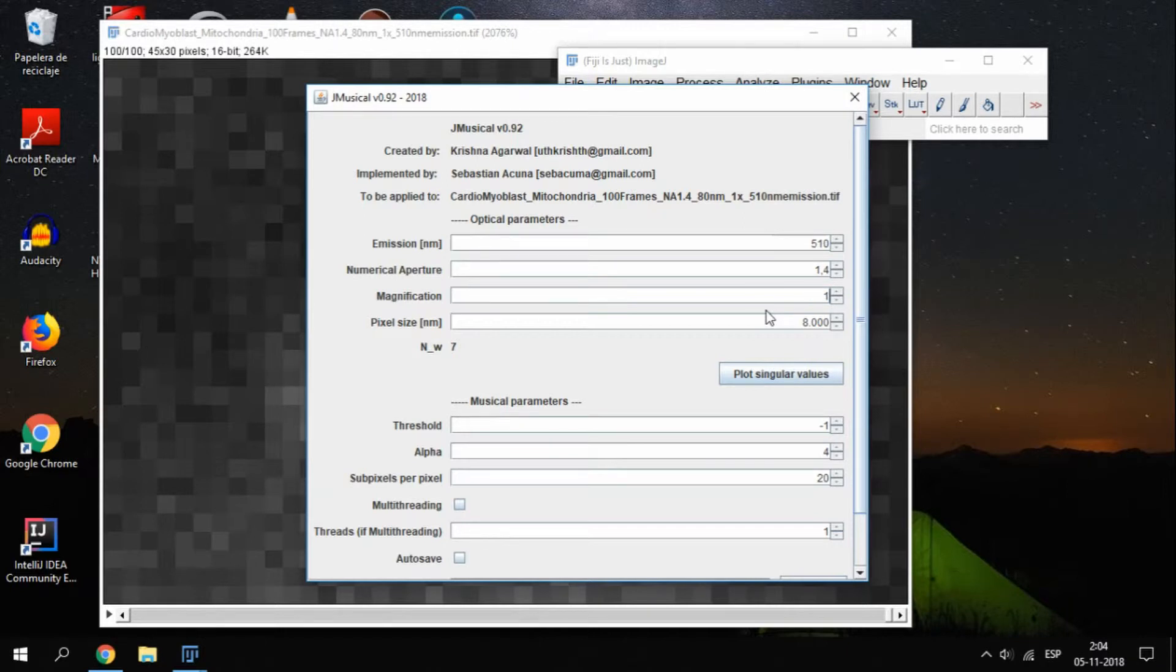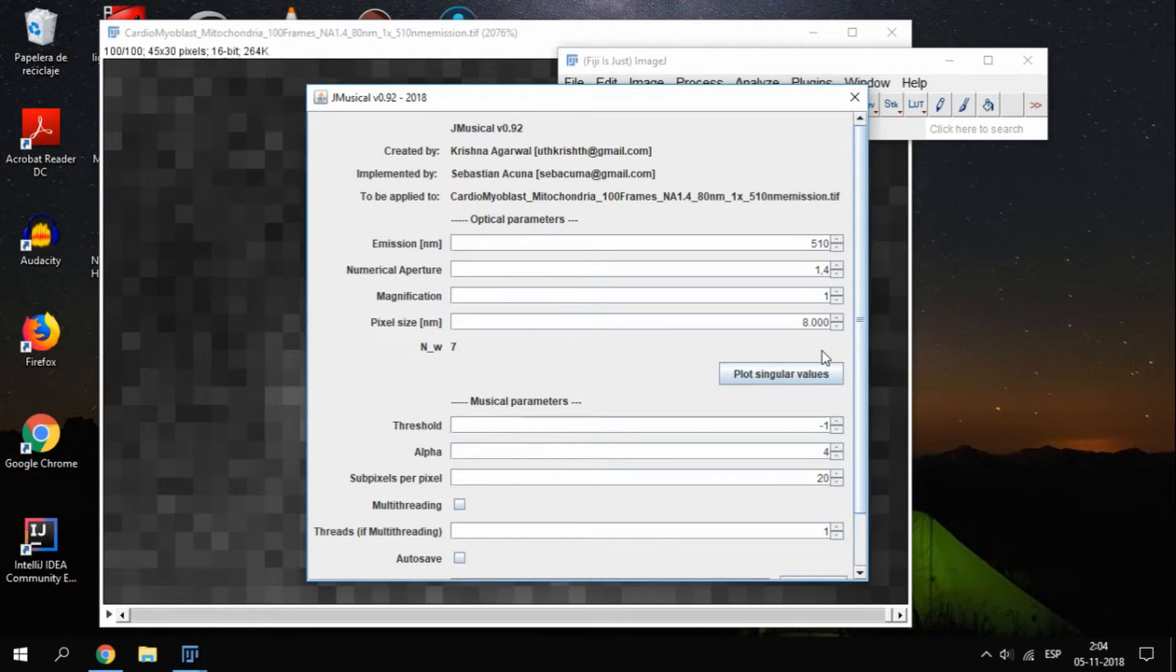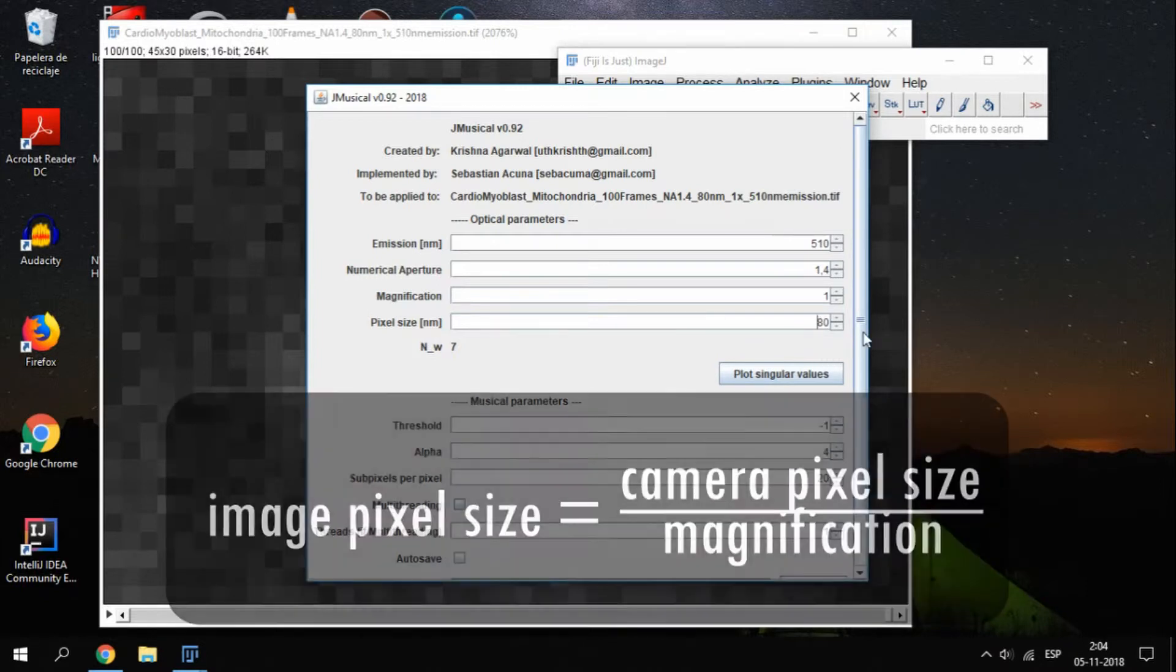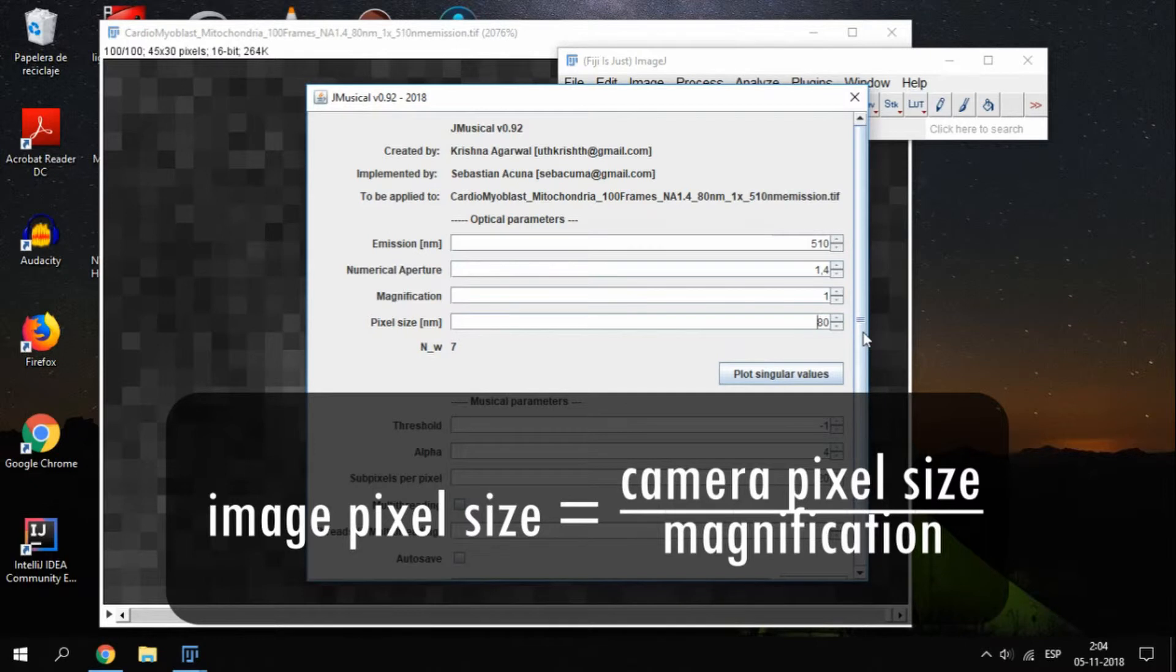The magnification will be set in 1, and the pixel size, which in this case is the pixel size of the image, will be 18 nanometers. To convert from one format to another, you can use this simple formula, which states that the image pixel size can be obtained by dividing the camera pixel size by the optical magnification.